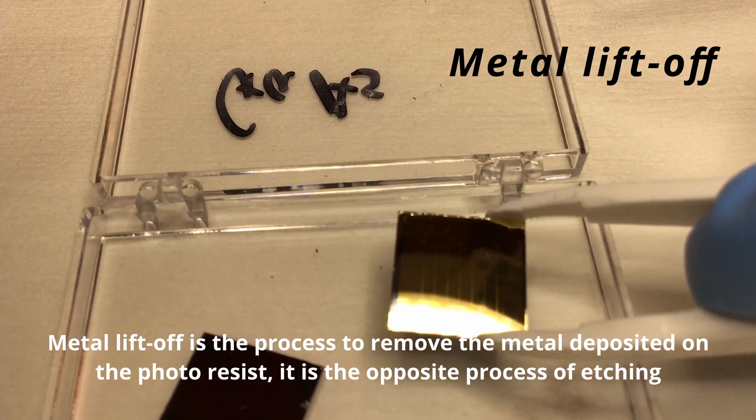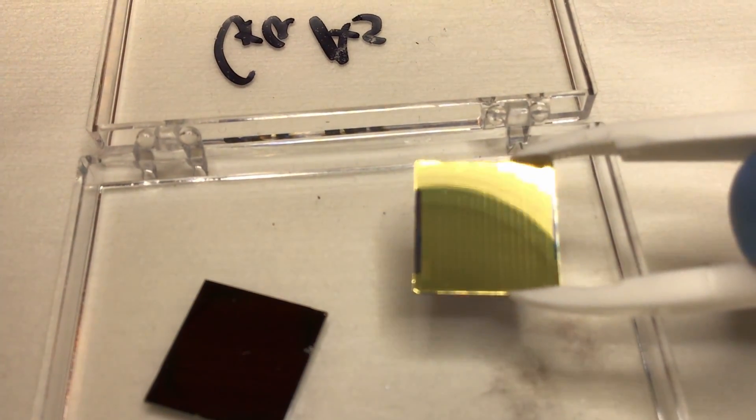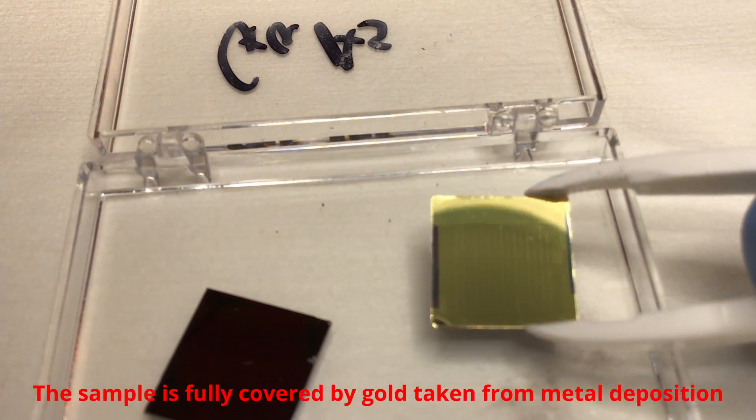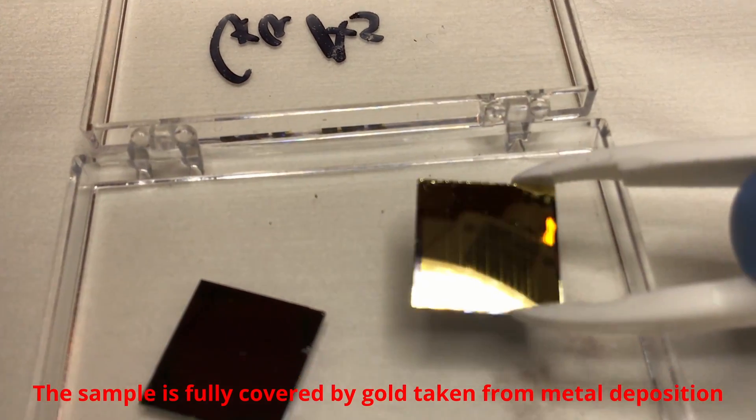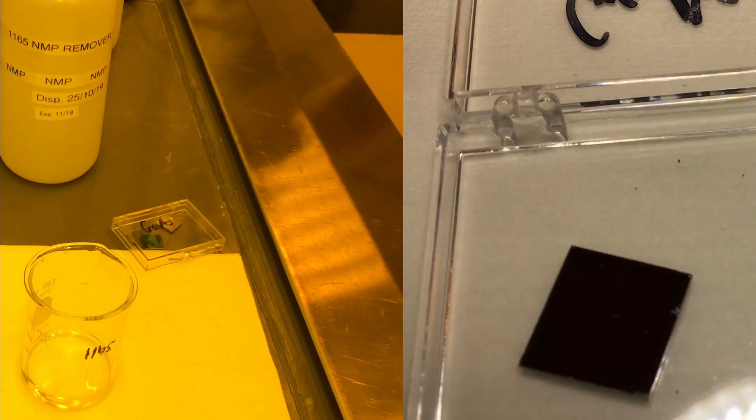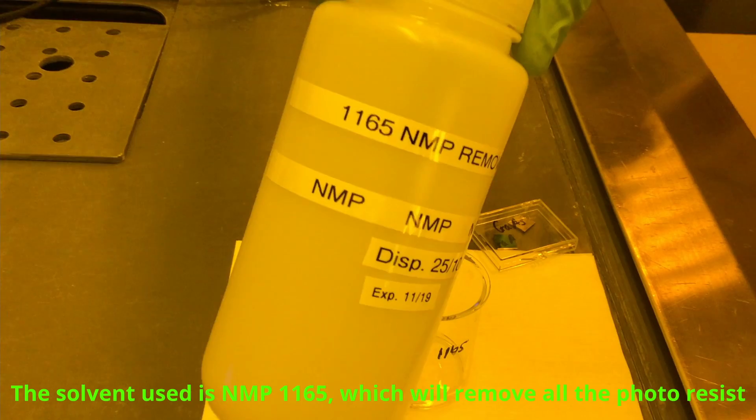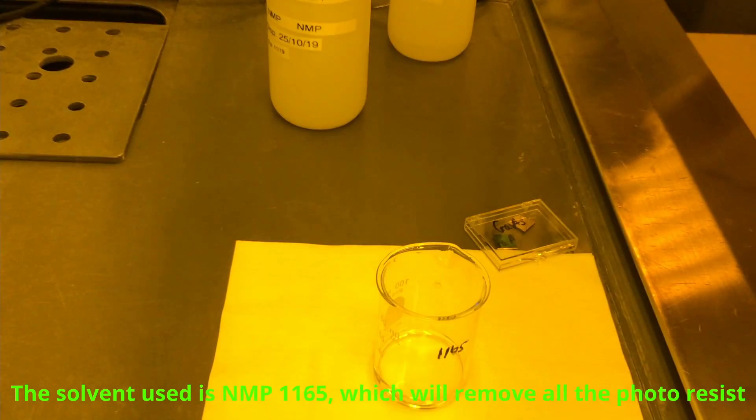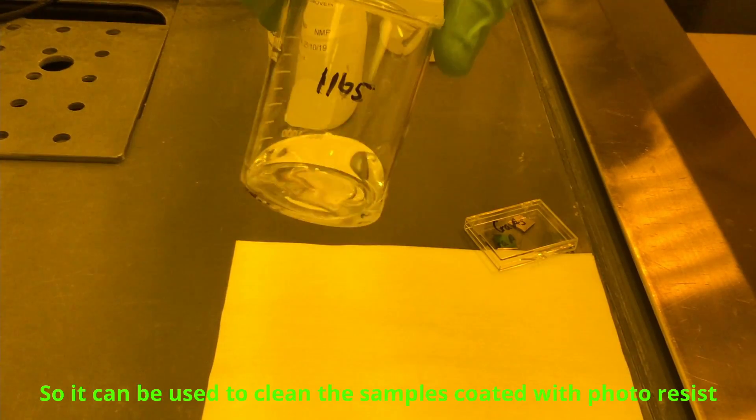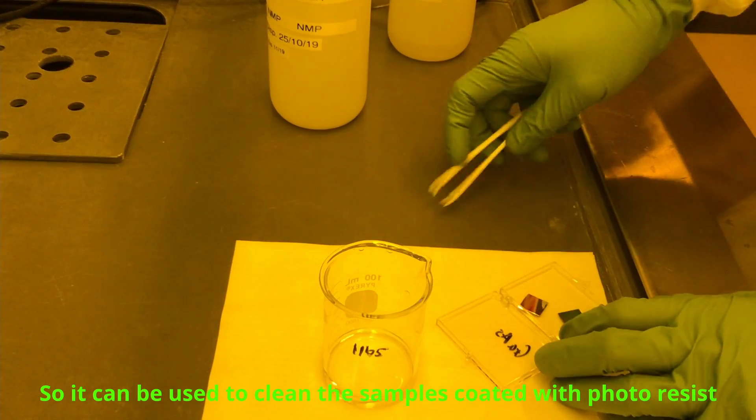Metal lift-off is a process to remove the metal deposited on the photoresist. The solvent used is NMP 1165, which dissolves the photoresist. The metal coated on the photoresist will be removed when the photoresist dissolves into the remover.